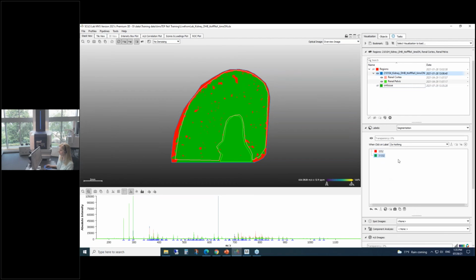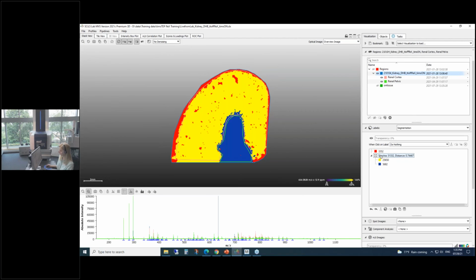For the moment, I'm going to go back to segmentation, and I'd like to show you what else can happen here. As I go further into the segmentation, which I tend to call the segmentation tree, I can start to view additional areas that have similar molecular fingerprints. You can see that in this kidney tissue section slice, I again am grouping based on the tissue architecture. So the molecular profile for each of the pixels are actually similar and showing up within this segmentation analysis.